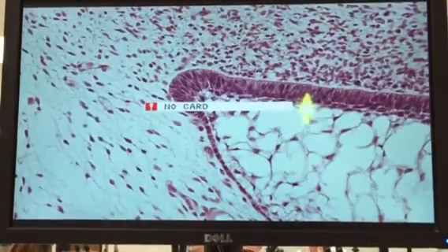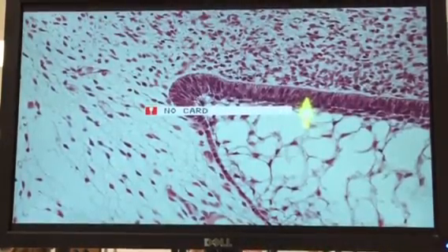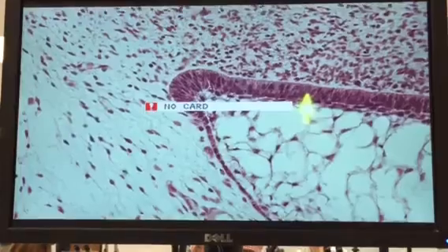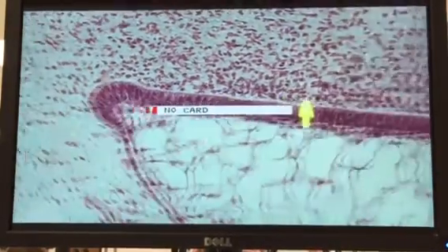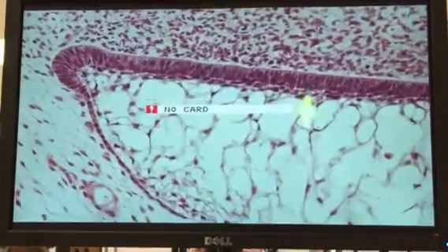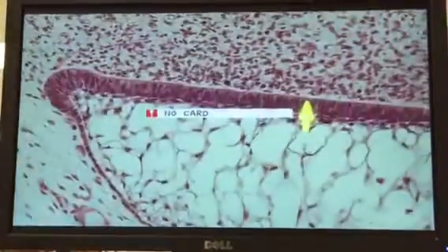Now, even though they look a little bit columnar, this is still morphogenic stage, at least for our purposes. You can see a little bit of a cell-free zone. And as we come up, well, you can see the stratum intermedium there, stellate reticulum.